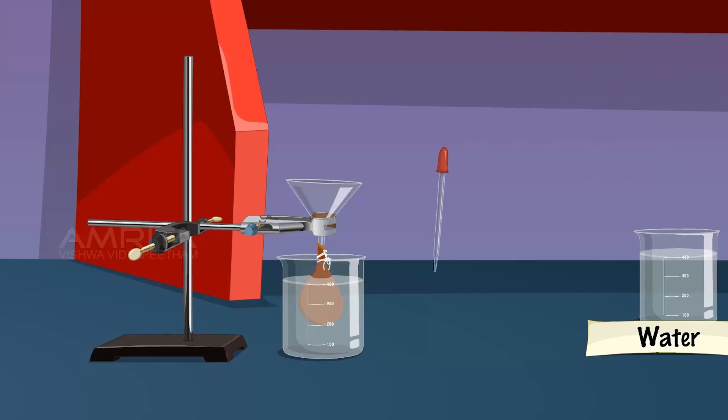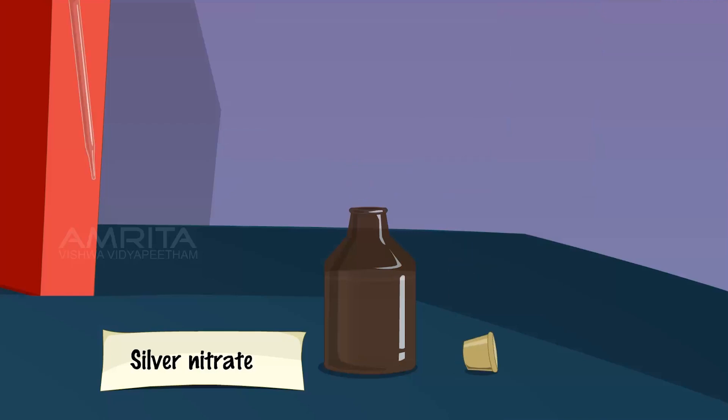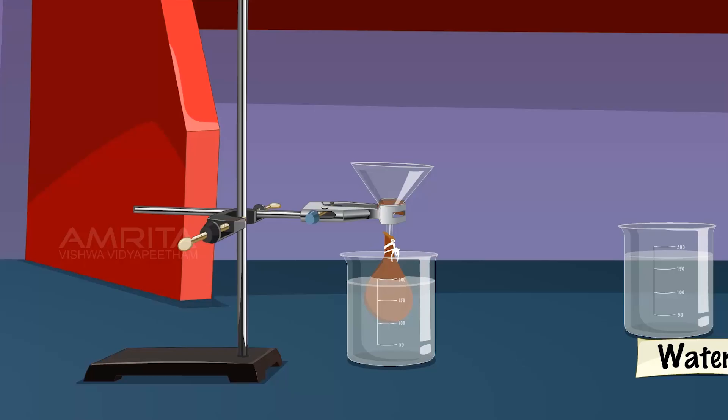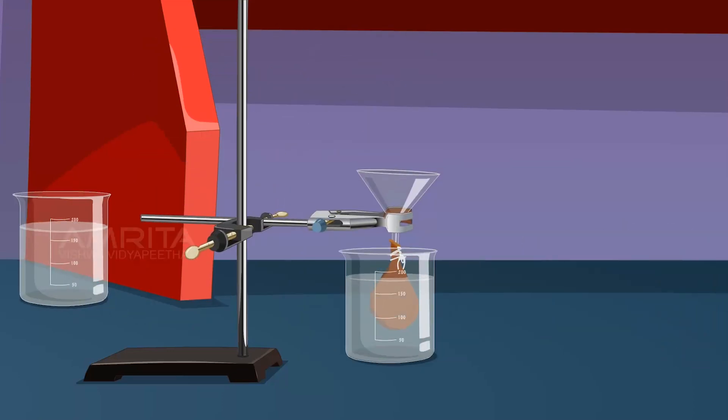After half an hour, take a small amount of water from the beaker using a dropper and transfer it into a test tube. Take a few drops of silver nitrate solution using a dropper and add them into the test tube containing water. A white precipitate of silver chloride produced immediately indicates the presence of chloride ions in water. Replace the water in the beaker with fresh distilled water and allow it to stand for 10 minutes.